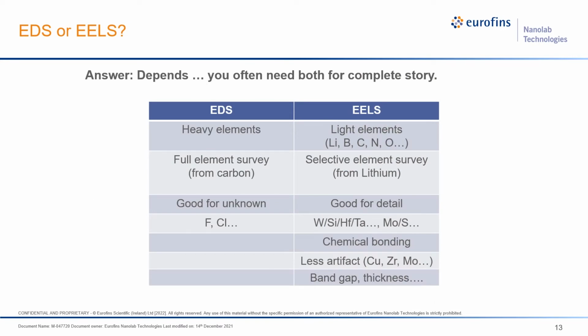So one question that we are always asked by our customers is, should I do EDS or EELS? And the answer is never easy. It really depends on what kind of material you're working with and what your analysis purpose is. So it is really important that we talk about this first before the analysis. So here is a very brief summary of EDS and EELS, their respective advantages and disadvantages.